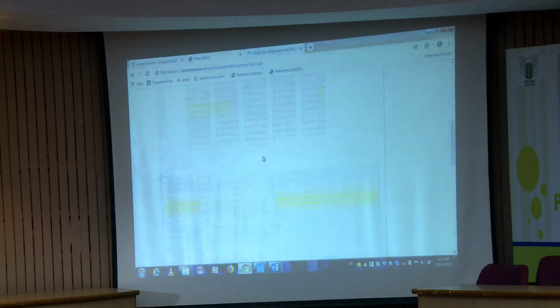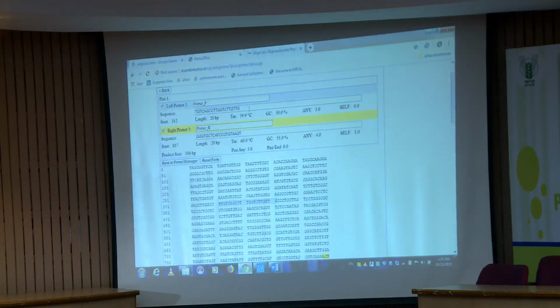So, you just take this, just copy it down somewhere in some Word format or some Excel format, just to have a track of what all are the sequences from a particular gene. So, this is your forward one and this one is your reverse one. Now, it has given you the size, whatever range you mentioned, 500 to 600 bases, right. So, it has mentioned that the PCR is 506 base pair. The size of your PCR amplicon will be 506 base pair.